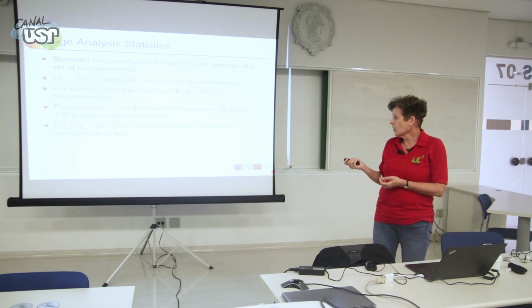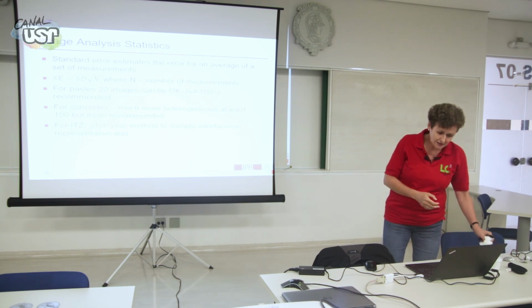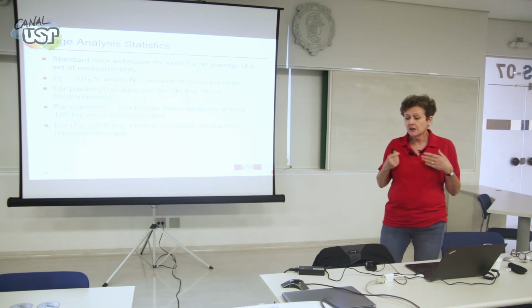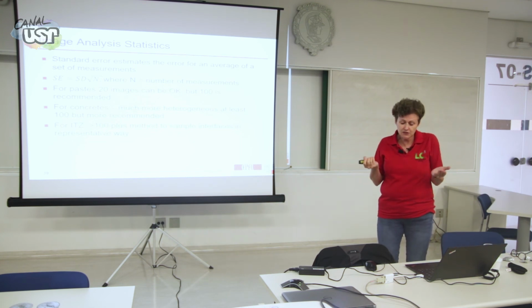And if you're going to look at a concrete, well, then you have the problem that you have to edit out the aggregates. We can do that, but it does mean that you need to look at many, many more images. And if you want to look at something like the interfacial transition zone, this is something we did and published, you've got to look at many, many more images.